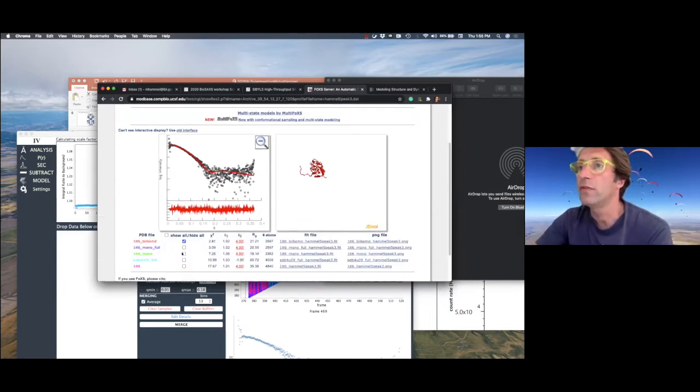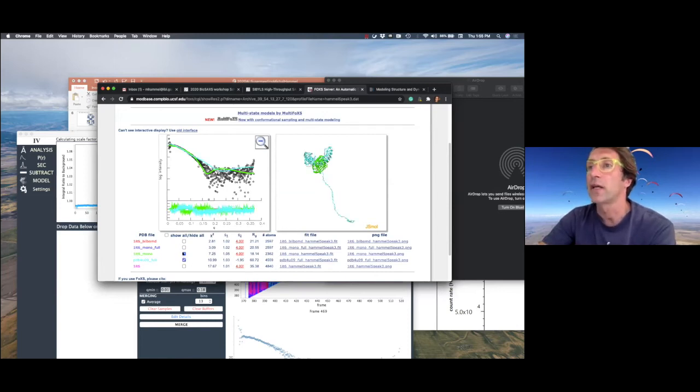Okay, so this is your PDB, and I go back. Okay. So this is PDB. Obviously, the PDB has 2 particles, so they're not fitting well. So you don't want to do that. So it's not a dimer or whatever it is right here. That's the asymmetric unit. This is a monomer, and it seems better, but still we have a chi of about 7, which is pretty high. And this is the second particle, what's supposed to be in the mix, and obviously not fitting our data at all. So this is a very simple test if you know the structure of the protein.